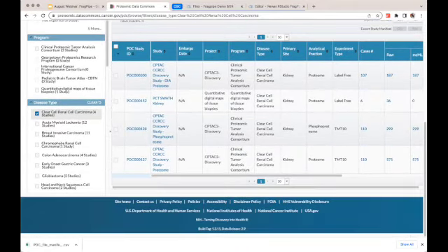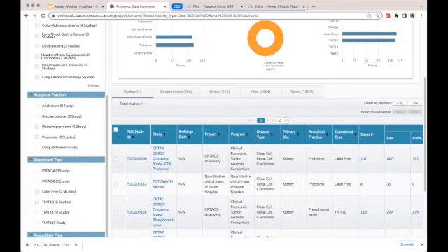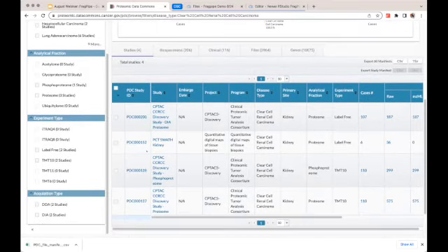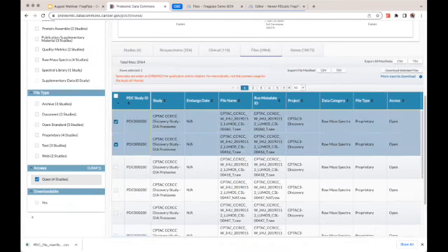Okay, you can scroll down and select the type of studies that you're interested in. I'm looking for the Files tab right here, and then I want open studies. So these have no restrictions to them. I'm going to just select like 2 of these. And then what you'd like to do is click on export file manifest. So you want that as a CSV.